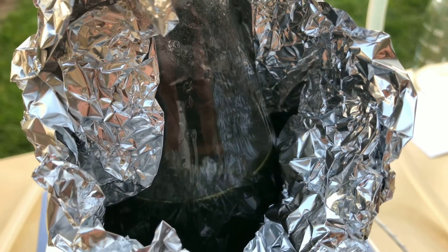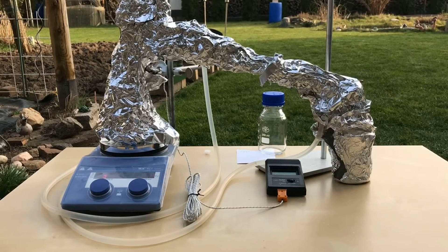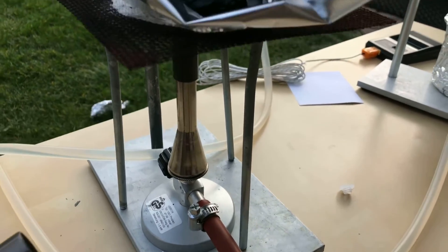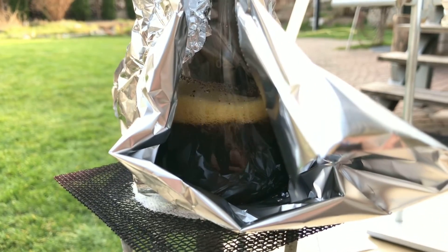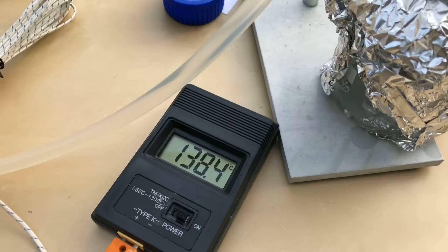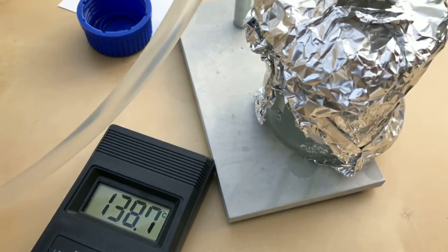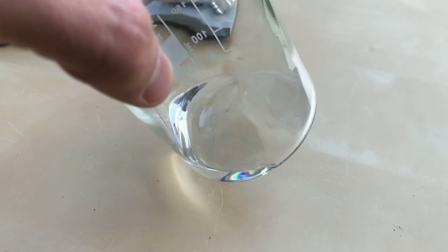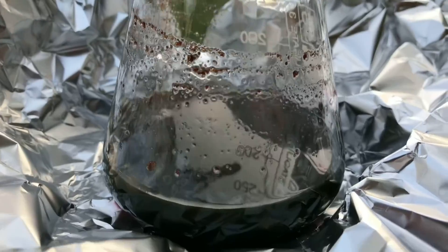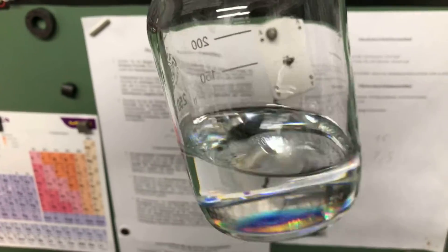Styrene boils at 145 degrees Celsius, so everything between 140 degrees and 150 degrees Celsius was collected and everything else was discarded. Because I got tired of waiting, the hotplate was switched out for a Bunsen burner at some point. Once the desired temperature was reached, the beaker was switched out for a storage bottle. The stuff collected in the waste beaker is definitely flammable and it's probably a mixture of all sorts of nasty hydrocarbons. In the end, we were left with a lot of tar, which I'm just going to burn at some point, and about 100 milliliters of what looked like pure styrene.